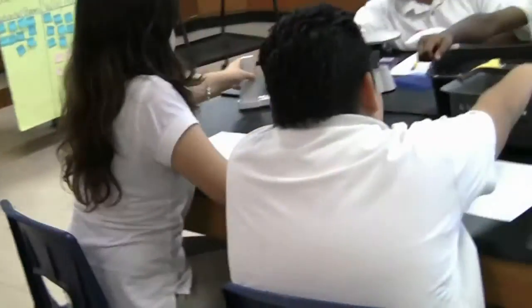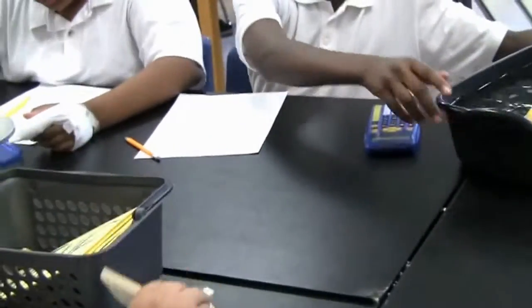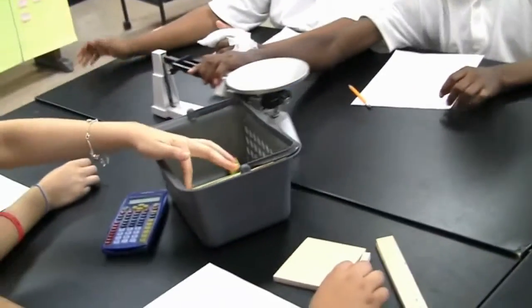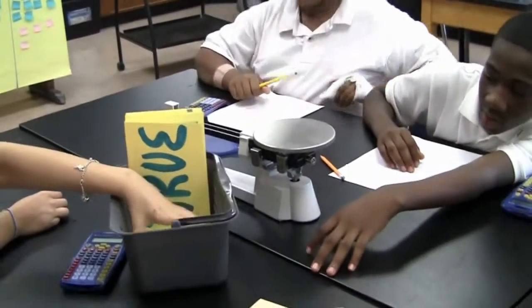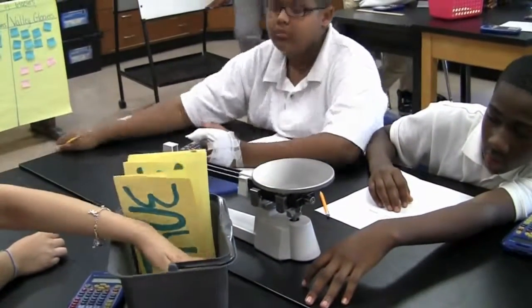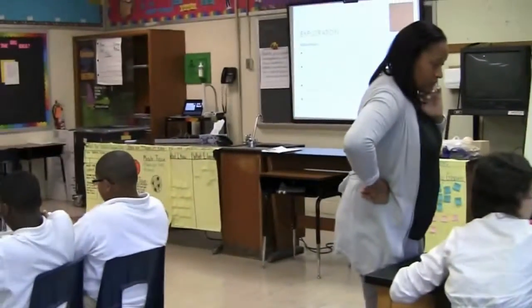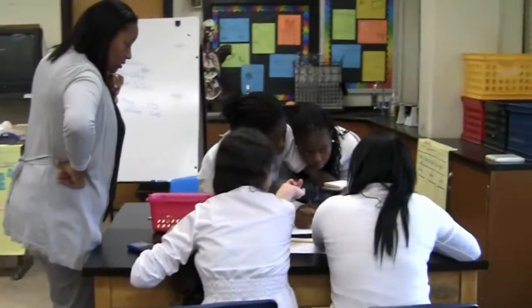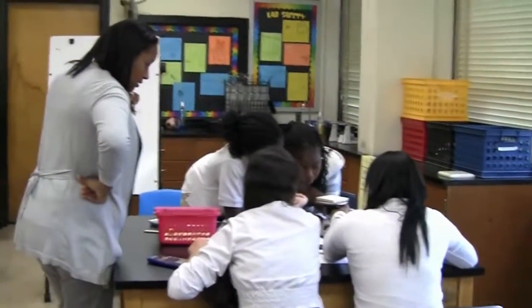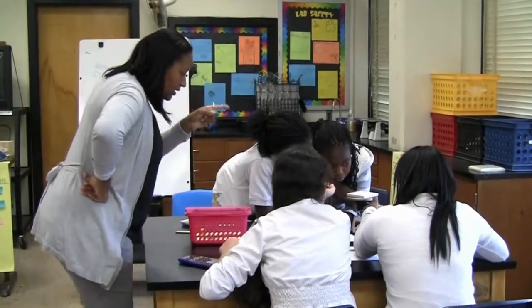Your work is through. I use the triple beam. So we're missing. Look at the mass, color block. Maybe another color. Volume is 3 divided by 5 so 4. Is it going with those? Keep going. No. 5.4. Go back.